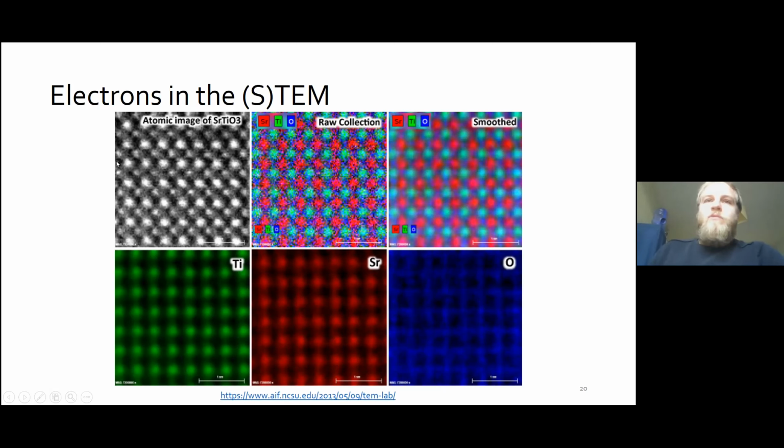But while we're measuring this image, we can also record the X-rays that come out. And so we get basically atomic resolution X-ray information. This is scanned over and over again, many, many times, and requires lots of electrons. So we can't really do it in our hybrid perovskites. But we can get these atomic resolution maps of these materials, which is, I think, personally super cool.